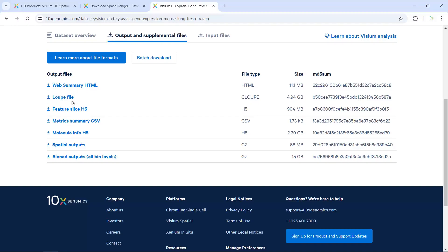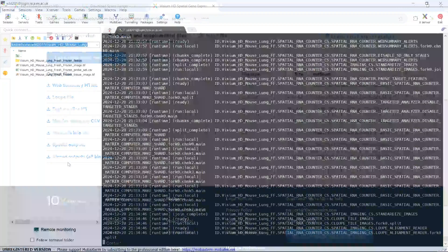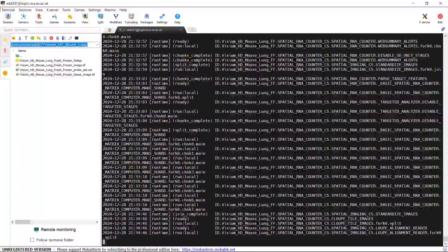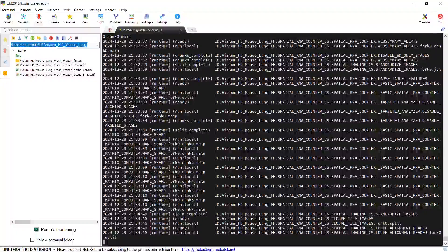You can use the loupe file to look at the gene expression on the tissue. You can also use the output to generate a Seurat object and perform your own analysis. I have a video tutorial showing how to analyze the VGM-HD data for human pancreatic tissue — you can watch that video if you want to perform your own analysis. The computer is running the analysis, so I'm going to stop the demonstration here. Hope this video tutorial could help your spatial data analysis. Thank you.